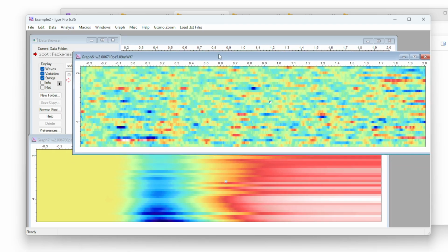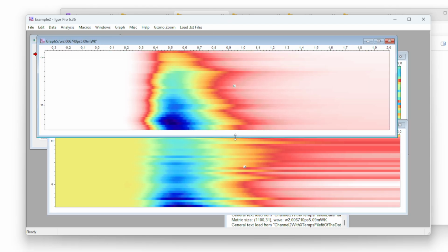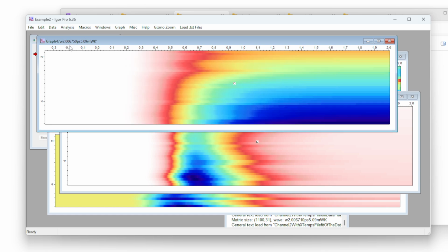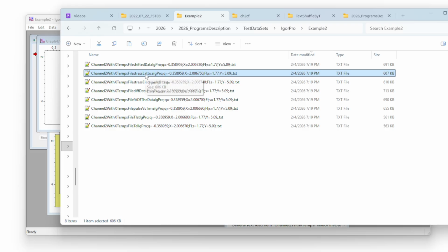Here, this is the difference between the experimental data and the temperature model. This is model data, and sometimes you can tell just by looking at how the file looks. Sometimes you need to look at the code. For example, here is 6750. For 6750, we go here and find that it is stress lattice 6750.